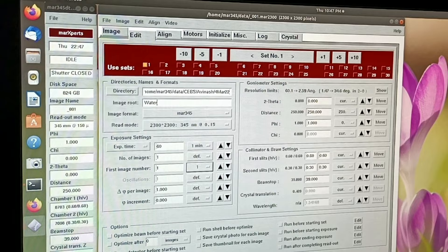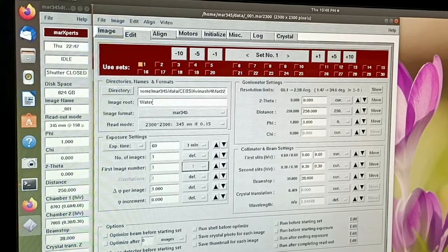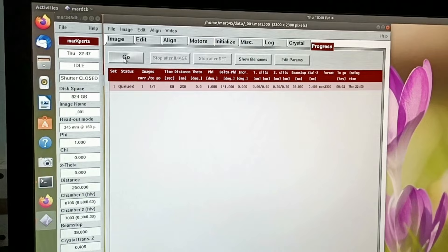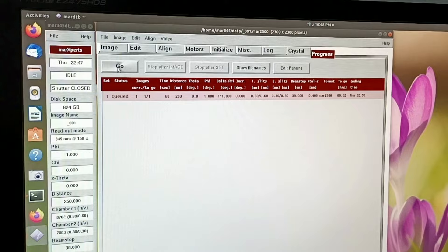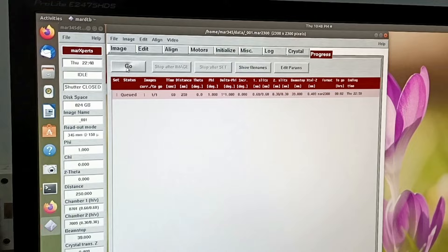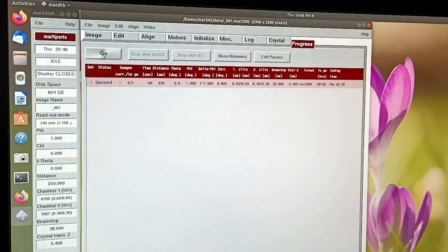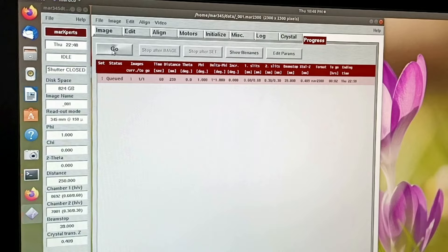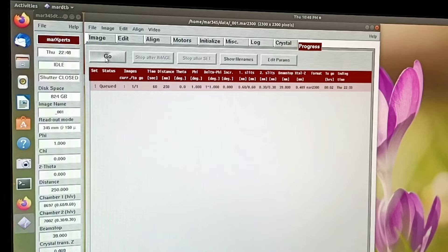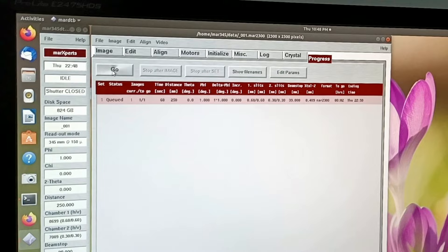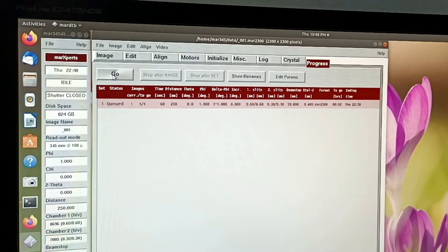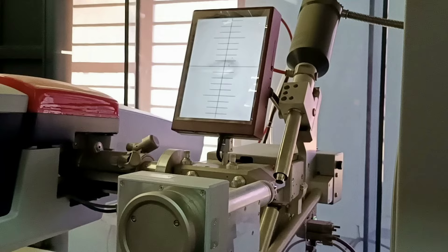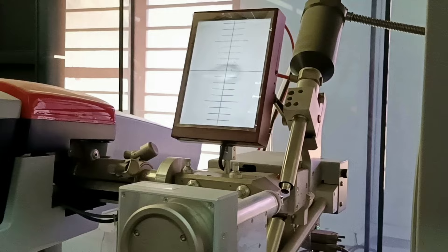The oscillation angle and other parameters are quite standard so we are not changing them. We press go, and since the source is already turned on, we need to go out of the room — that's the safety protocol we follow here. We stop the video, go out, and once the exposure is done we come back to show you how the ice rings for water look. Our water test is now done.